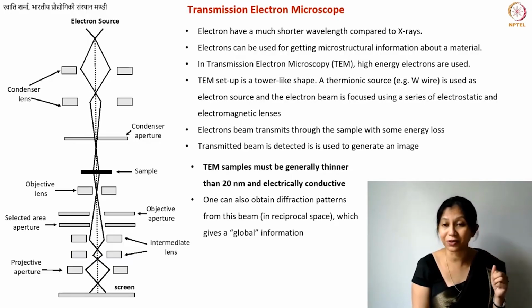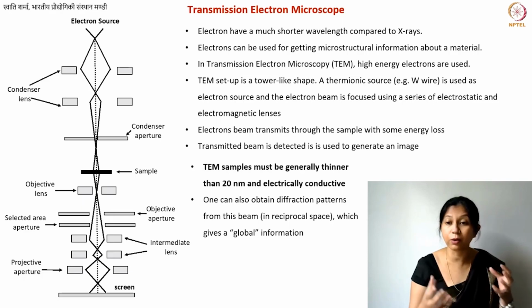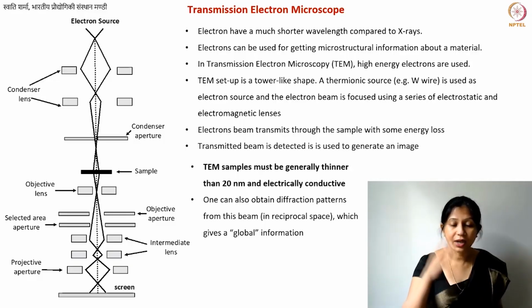Okay, we will not again go into details, but as the name itself suggests, there is an ion beam, which is a high energy beam, which can be used for slicing your sample. That also needs to be done inside a microscope, because you should be able to see what you're doing there. Often the scanning electron microscopes are also equipped with this ion beam setup, or you can buy a separate focused ion beam setup. There you can actually slice your sample and then get this very thin, ultra thin sample.